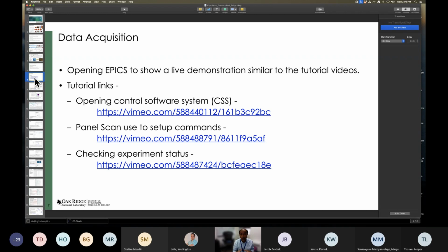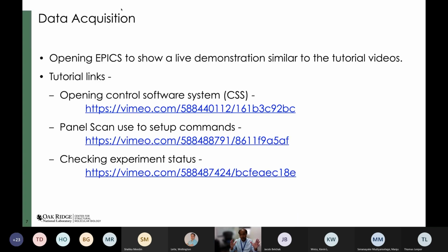If it becomes a little complicated, we need to figure out whether we have something that we can approximate for your system and then find a way to address that. Most cases we can. Okay, data acquisition now. That's the same EPICS system that I showed you right now, but I'll go back to that as I finish this.